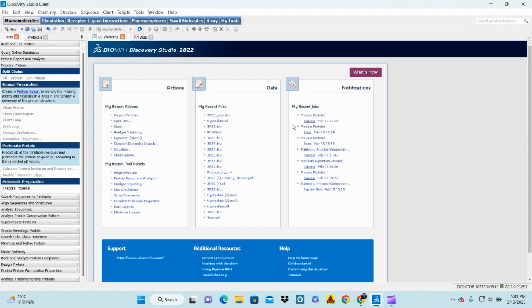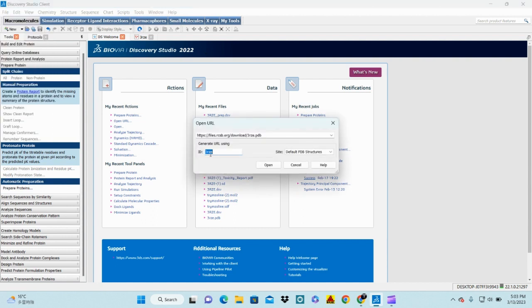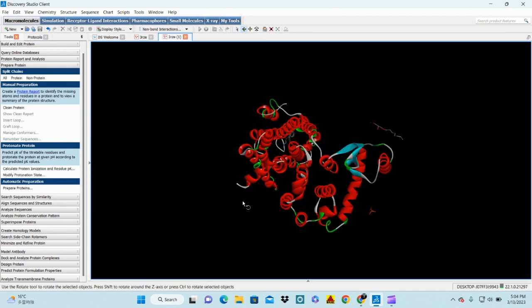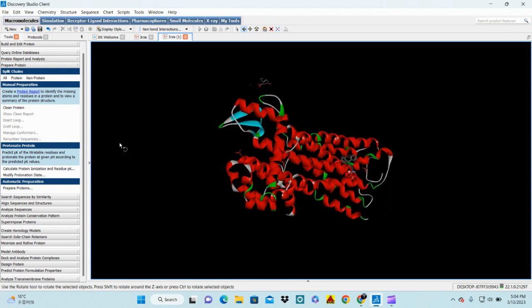In my previous lecture I already covered how to download your protein sequence from a database and your ligand from a database — the ligand is also your drug. Here we download the protein by ID directly with the help of Discovery Studio. I enter 3RZE and open it, which gives me the crystal structure of my protein.